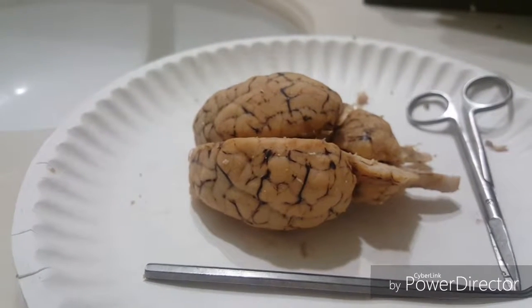I'm going to be doing Lab 7, the central nervous system, where I will be going over some structures on my sheep brain that I have already dissected. This is my dissected sheep brain.